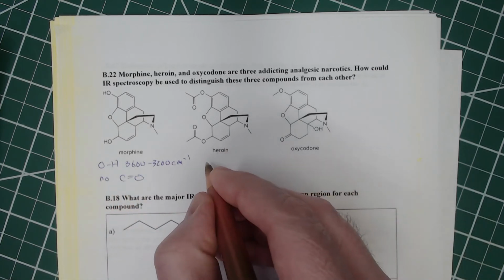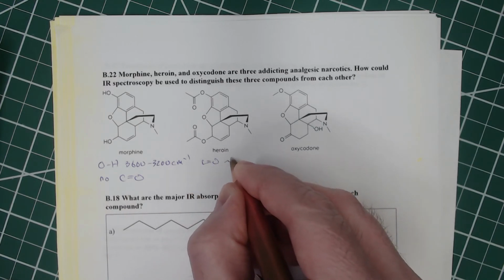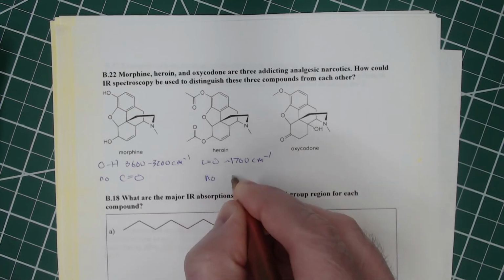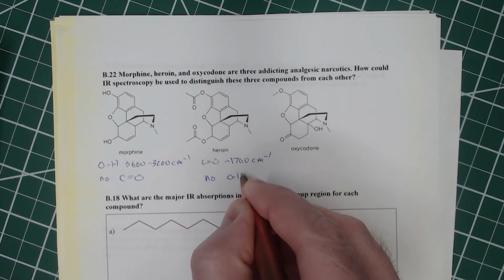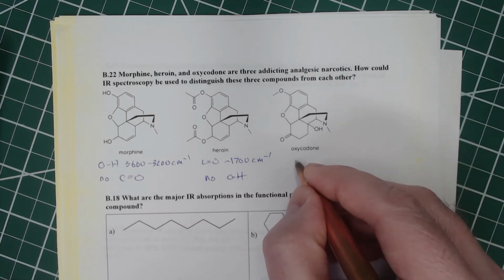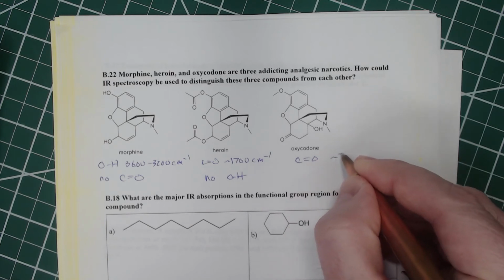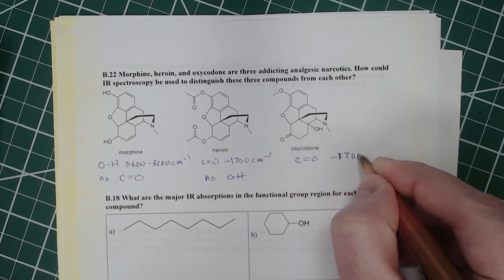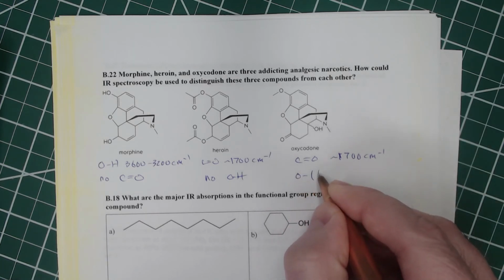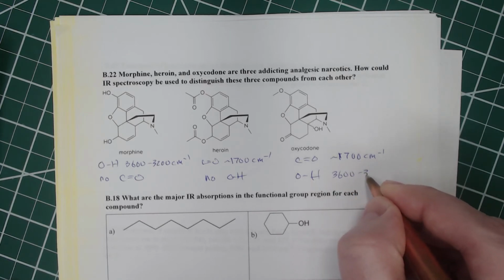This one will have a carbonyl at about 1700, but no OH. All right. And this one will have a carbonyl again at about 1700, but it also will have an OH at the 3600 to 3200.